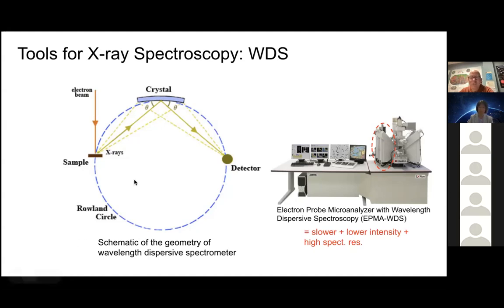One of the minor disadvantages is this technique is a bit slower, but the increase in precision is worthwhile for how much more time it takes.